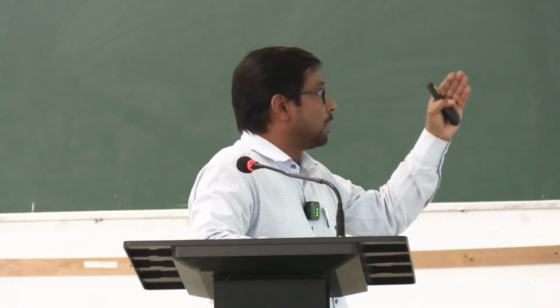First, the optical microscope, which mainly uses a light source, the visible range of light. It has another five divisions: brightfield microscope, darkfield microscope, phase contrast microscope, fluorescent microscope, confocal microscope, like that. Next we have the electron microscope, which is also of two types, TEM and SEM. Then another, basically used for research purposes or to find atomic structure, is scanning probe microscopy.